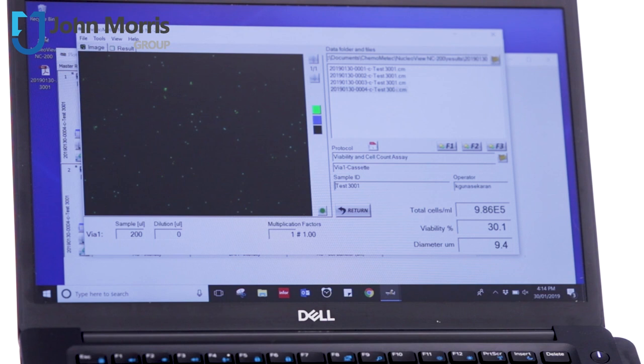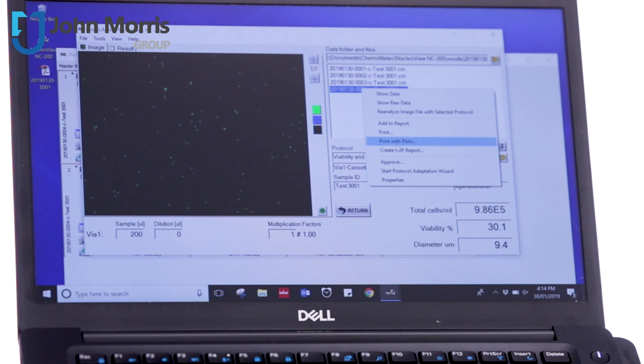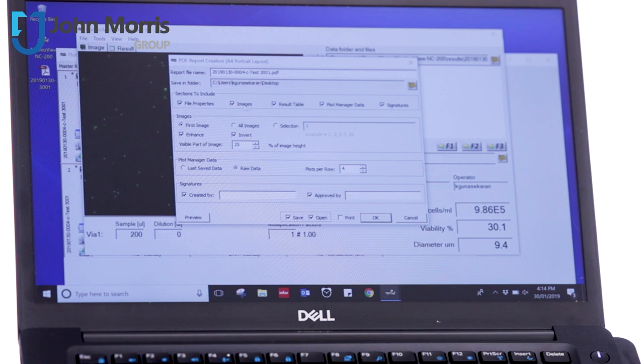Another nice thing that's really worth mentioning here is that you can actually generate a GMP compliant report. So if we create a PDF report here, it'll ask us which selections we want to include. And if we want to include all of them, we'll click OK.